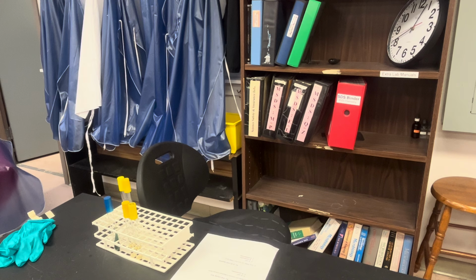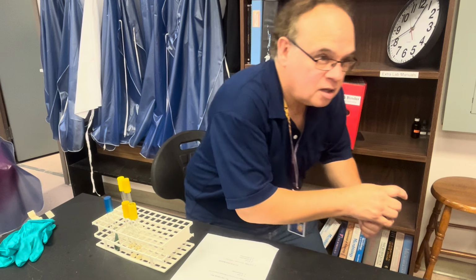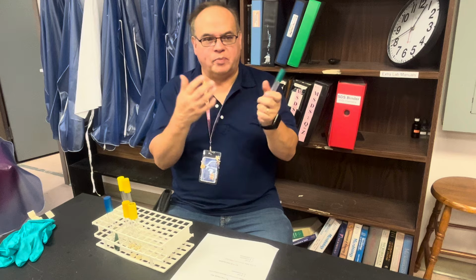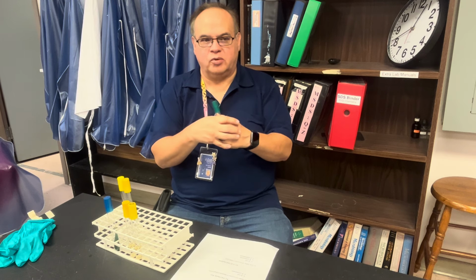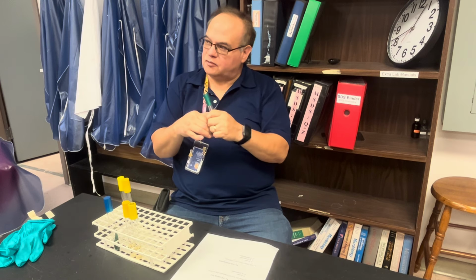Tryptophan can be broken down enzymatically by an enzyme called tryptophanase. If it breaks it down, it produces indole, pyruvic acid or pyruvate, and ammonia. We don't care about the pyruvic acid or the ammonia, but we can test for indole production colorimetrically.